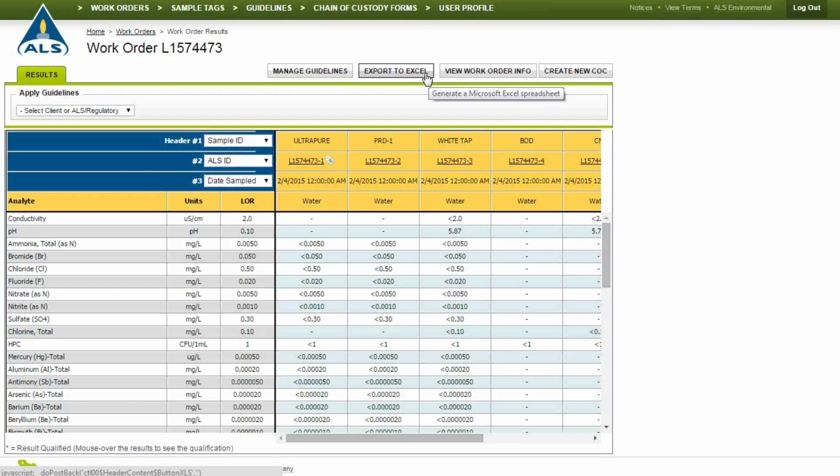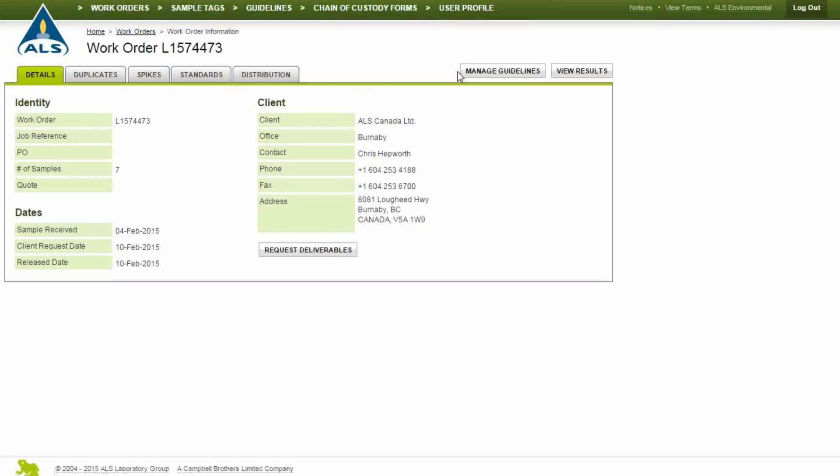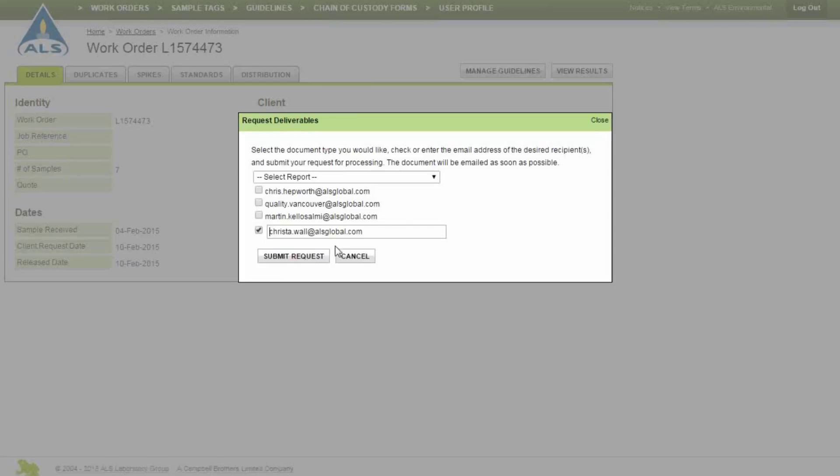Click Work Order Info to see the quality control details for the work order, including duplicates, spikes, standards, and client distribution contact information. To send a work order by email, click Request Deliverables.